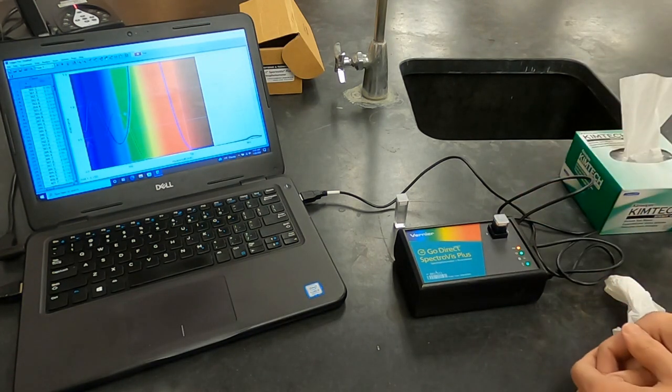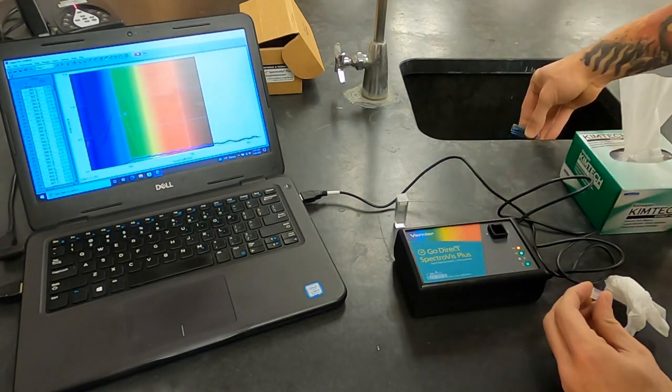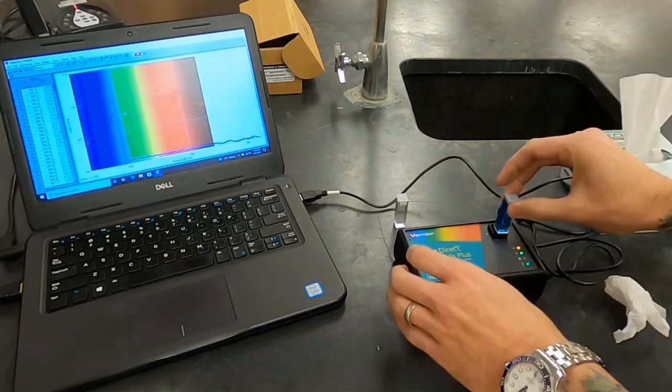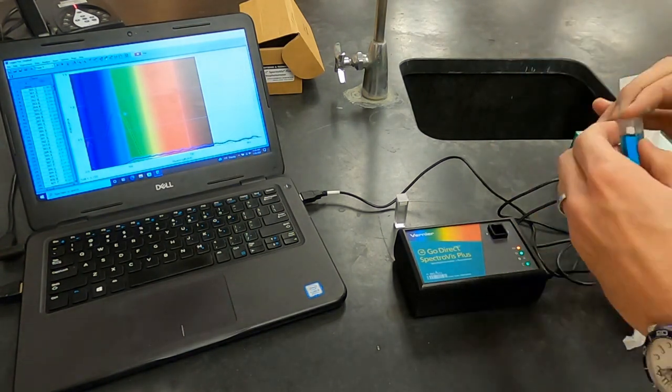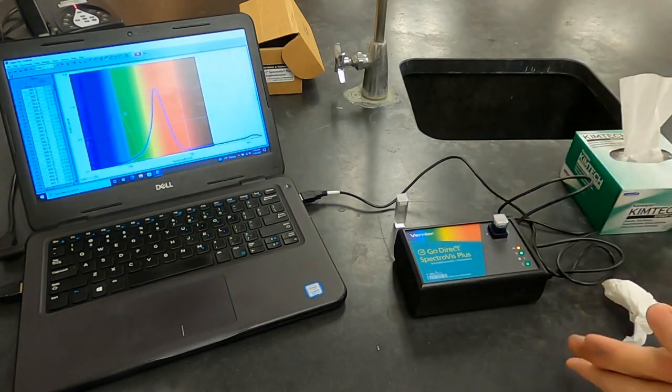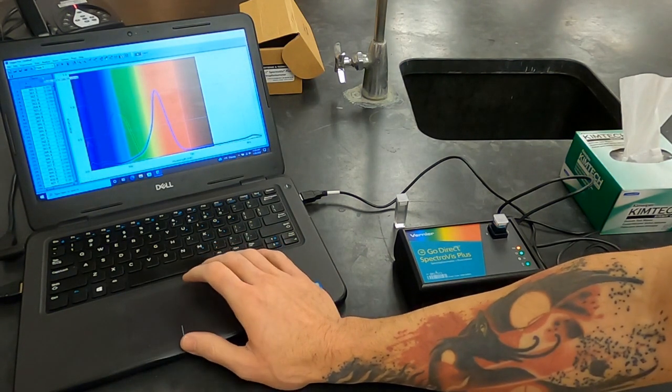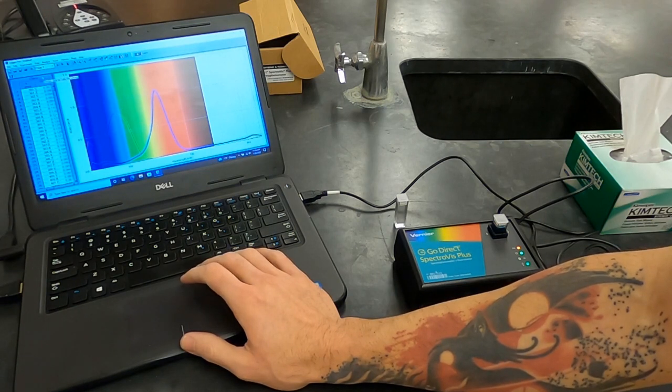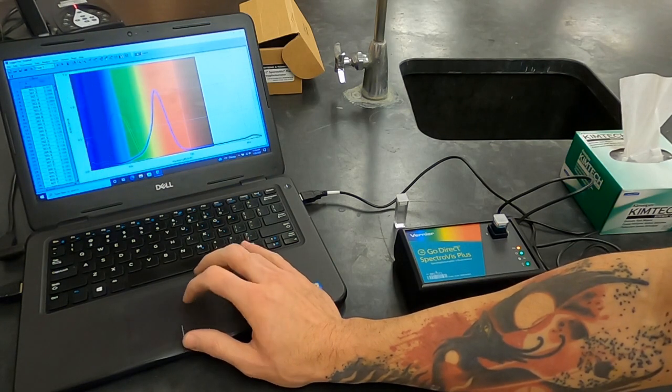This one definitely off the chart, so I'm going to need to pour this out and water it down. And finally, this has been watered down enough for green three that it is going to be within range. So I'm going to hit stop. And double click on the word latest so that I can rename this. And notice though it's not showing, it is saving each trial.